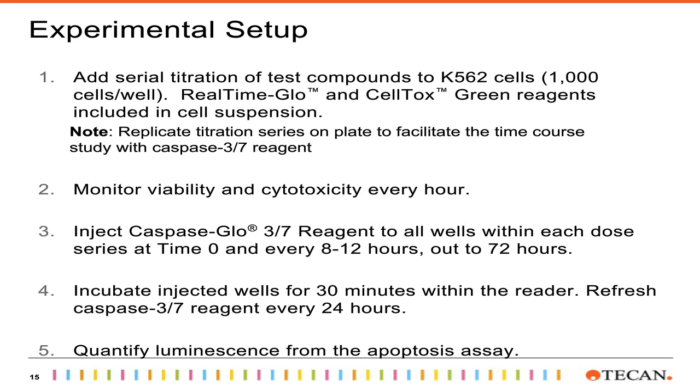So right now we're really just performing a time course experiment in a more traditional way. Once the reagent gets injected into the plate, it incubates inside of the plate reader for 30 minutes. I mean, it stays in the plate reader throughout the entirety of the experiment. And then once that 30 minutes is up, the luminescence from that apoptosis assay is measured.